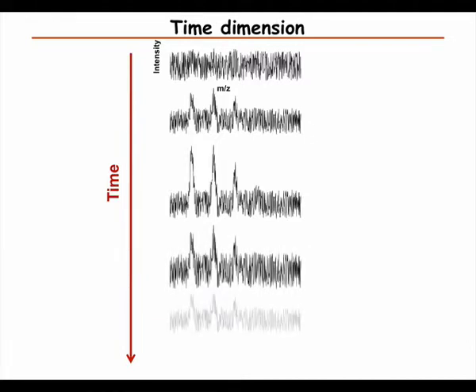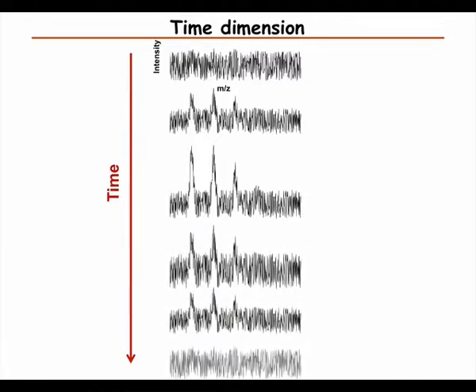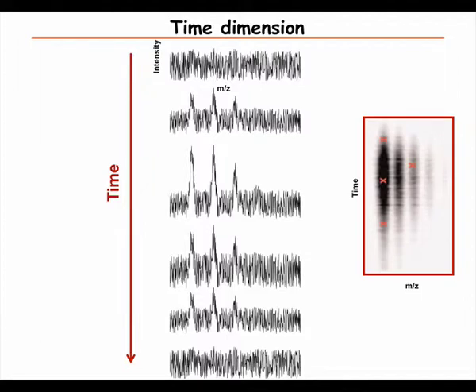In the case of LCMS, we also have the time dimension, and we can utilize that. Peaks and the isotope distribution should appear at similar times, then the peak grows and then it disappears. So this other dimension we can utilize to improve our peak detection, because we know that it should be quite continuous in time. This is just another way to show the same information.